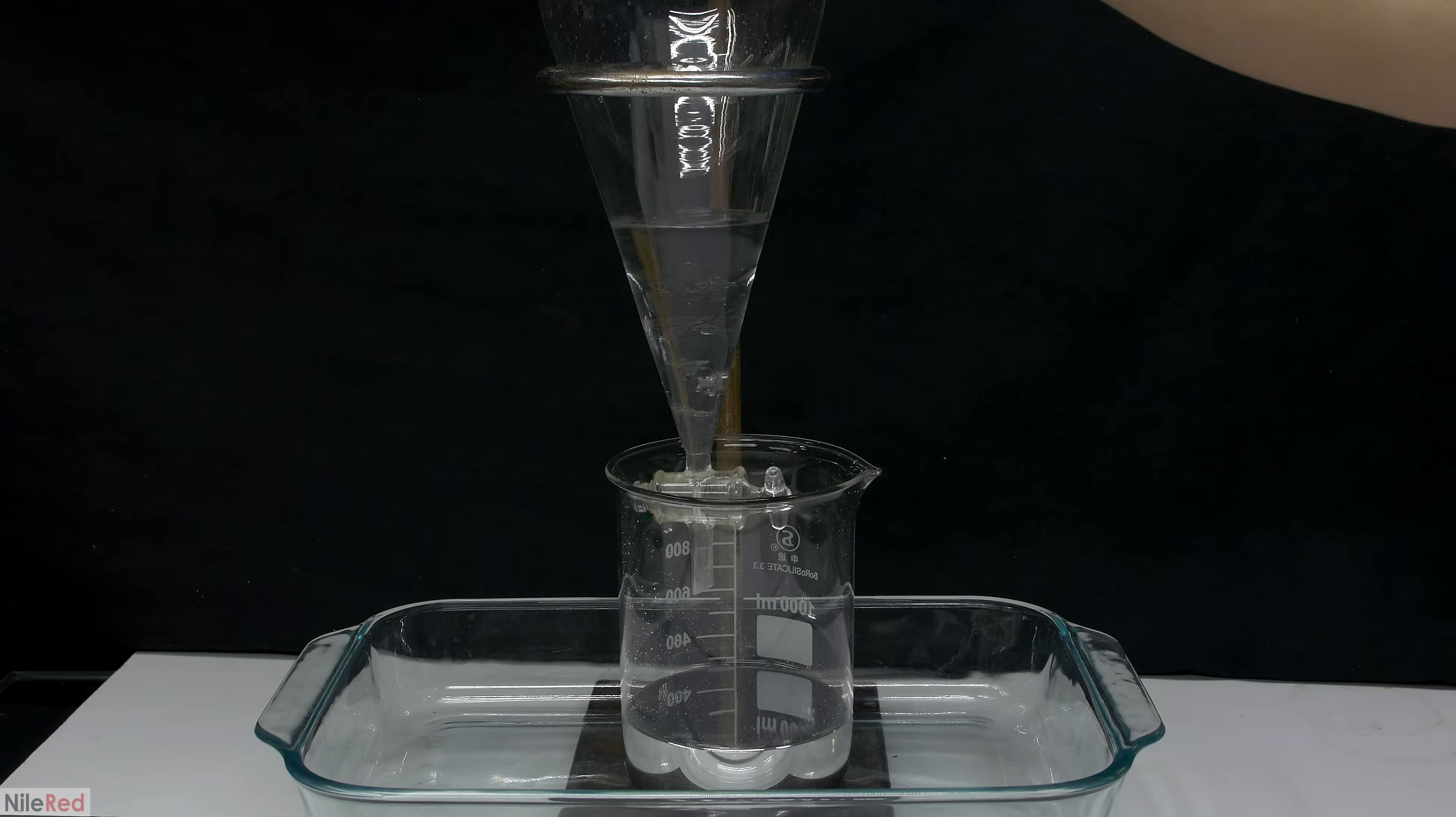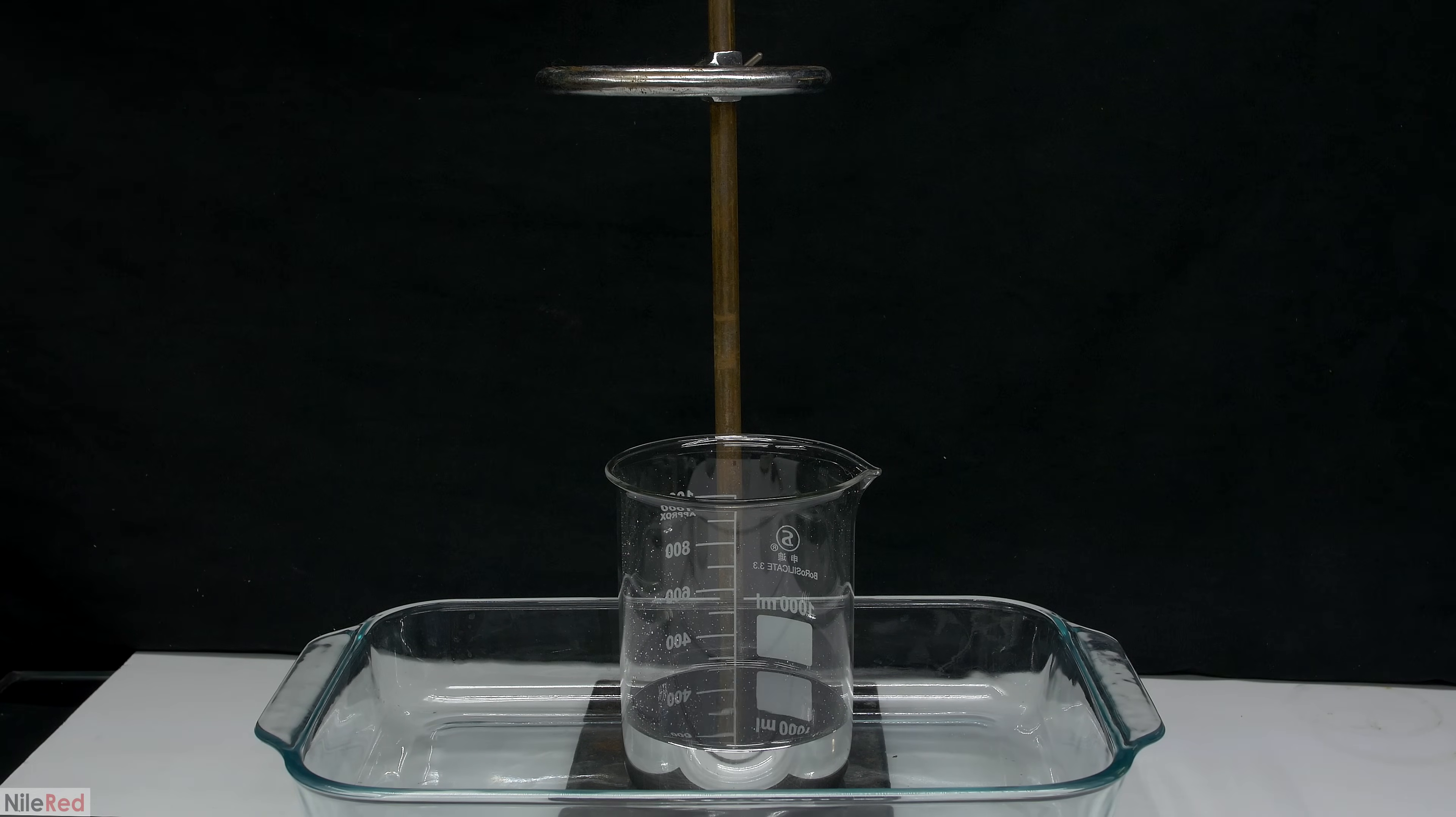Once I'm done draining away the mercury, the separatory funnel is taken away and the water is transferred to a mercury waste container. The water contains trace amounts of mercury, so it's really important to not pour it down the drain.